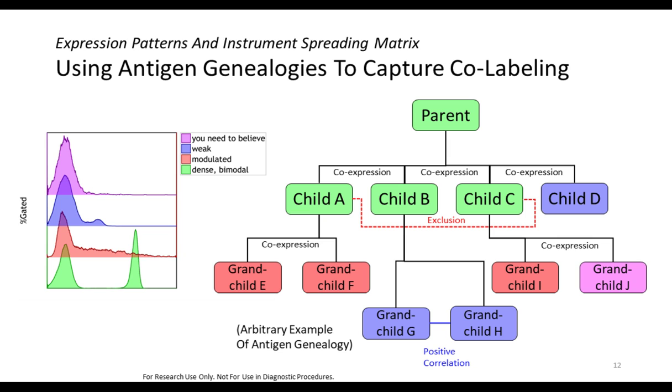When we want to talk about the biology in a certain antibody panel that we want to apply, it is very efficient to use antigen trees like we see here on the right. In an antigen tree, we can implement all the relationships between the antigens, and also by color coding this, we can show the expression profiles that are associated with these antigens.